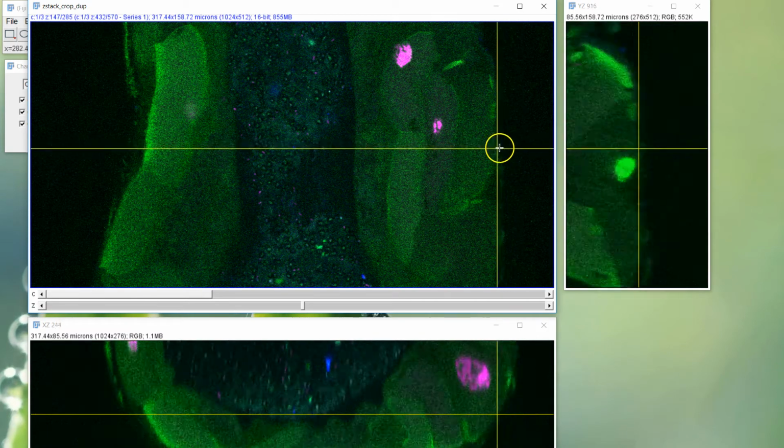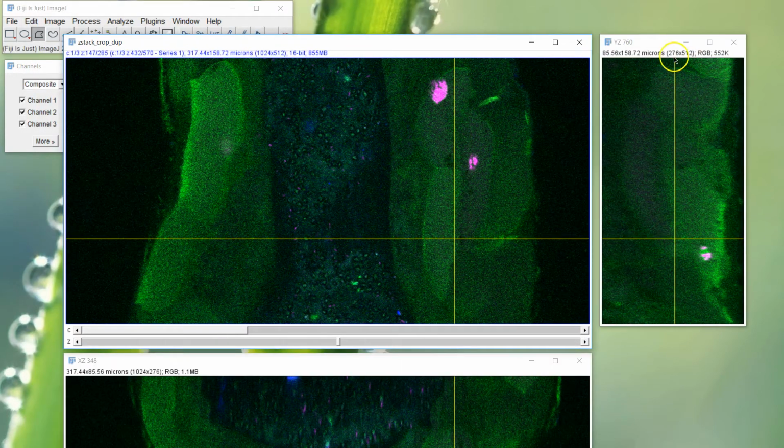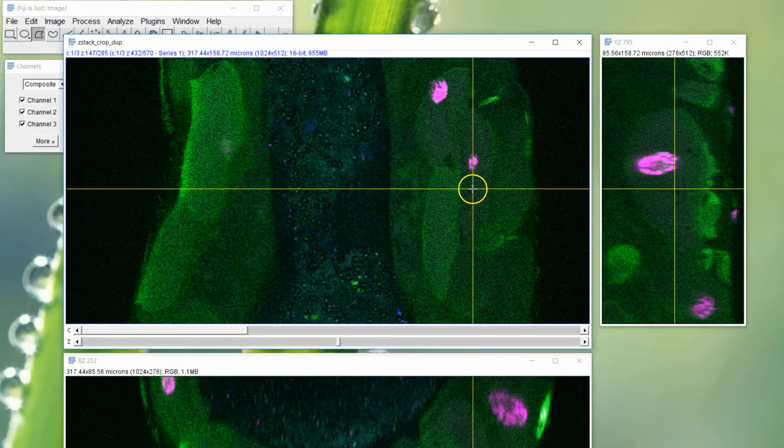So if we pick something we want to show, the next step is to try and save that and get an output. So let's say we have this image here, something like that, for example. We could save it quite readily. It's an RGB picture now. This one's a 16-bit data set. This one's just a picture on the side. So we can save it straight away as a TIFF.